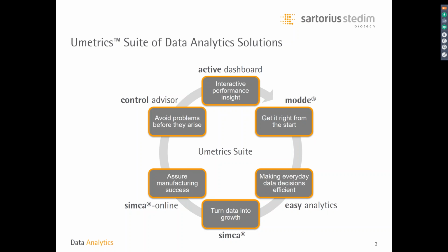If you look at the Umetrics suite, as we call it, which is a collection of tools, we have MODDE, which is design of experiments to create data for modeling. We have Easy Analytics, which is a data visualizer for non-multivariate users. We have SIMCA, and this is the heart of most of our data analytics, whether it be just some simple desktop analysis or a full-fledged supervisory control. It all starts with SIMCA, with the modeling.